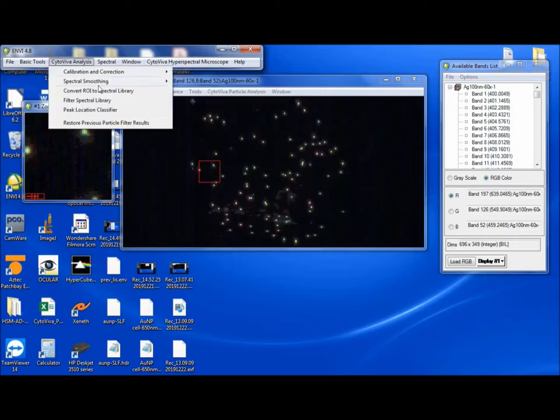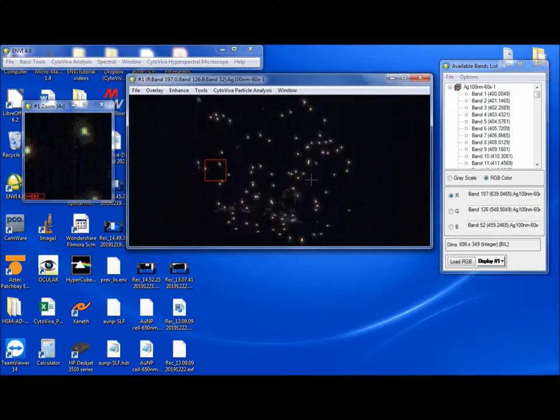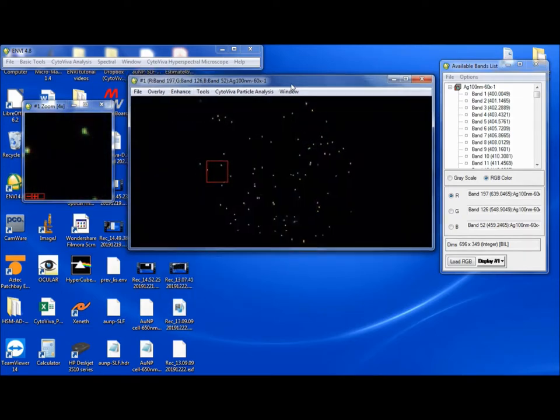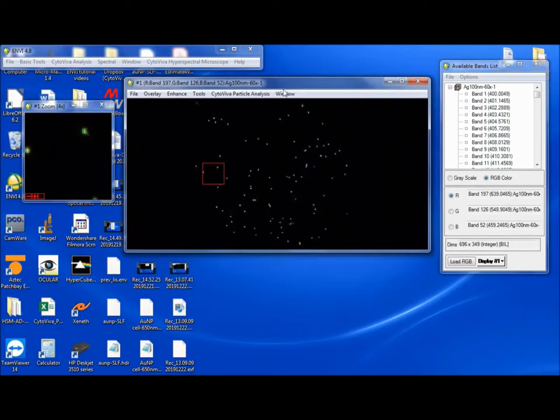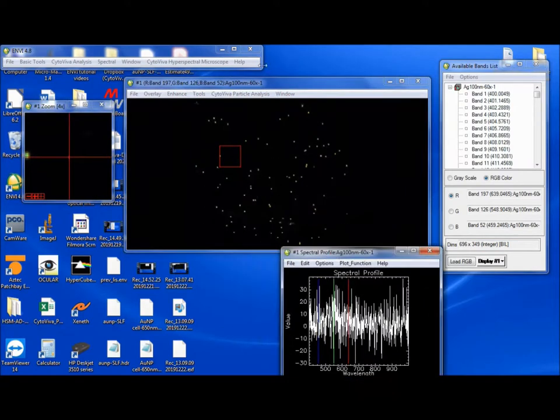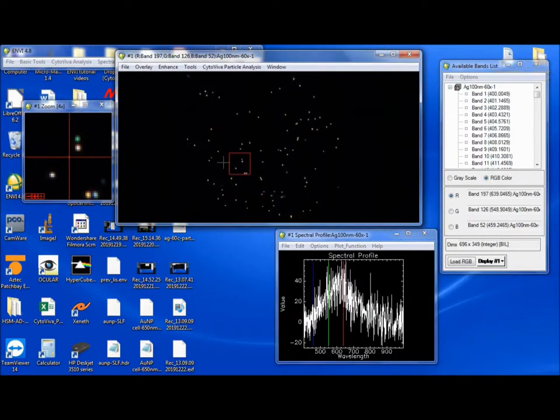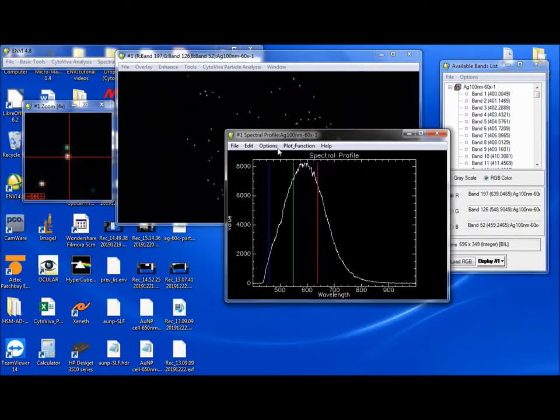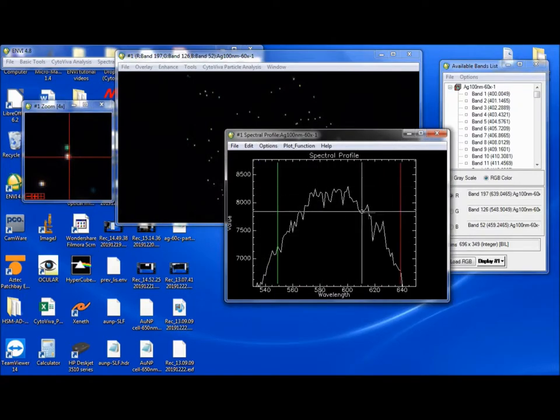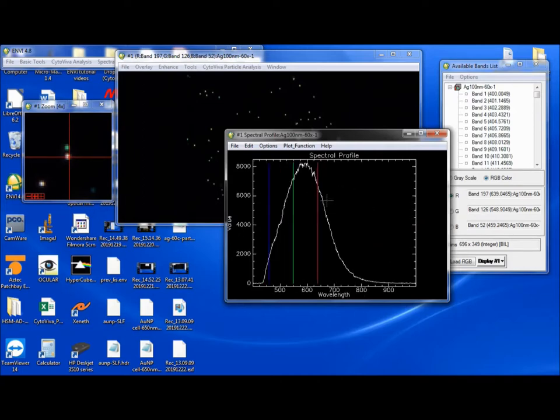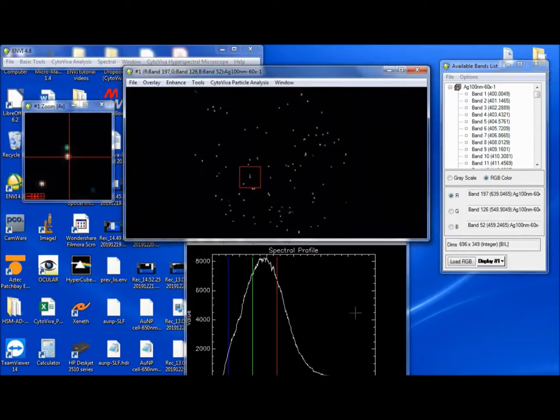So I have open here the 100 nanometer 60x silver data that we looked at when we did the peak location classifying webinar tutorial. And so here we have some silver particles, and if I bring up the spectral window here, we'll see even on these bright particles, if you zoom in, there's some noise that's just inherent in the spectrum here, even though it has a great signal-to-noise ratio. So if you do desire to smooth out these spectra in this image, you can do so using this tool.